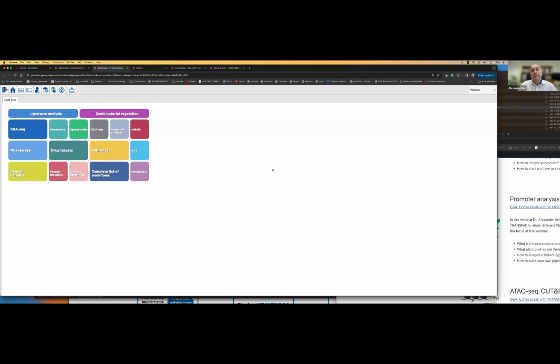All this kind of data, by the way, can be analyzed in the geneXplain platform. We will give you maybe 10 minutes to fill in this poll, and when it's ready, we will see the result.